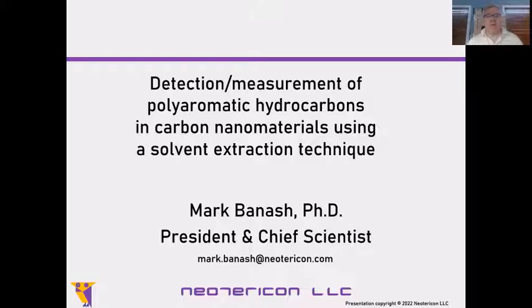Today, I'd like to talk about something which is extremely important with carbon nanomaterials, namely the presence of what are called polyaromatic hydrocarbons, and how you can measure and analyze for these using a remarkably simple technique.